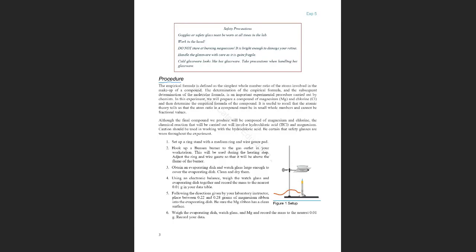What are you going to do? What is in here, you are going to take an evaporating dish, and what is on top is called a watch glass. So you are going to first record the weight of the empty evaporating dish and the watch glass.